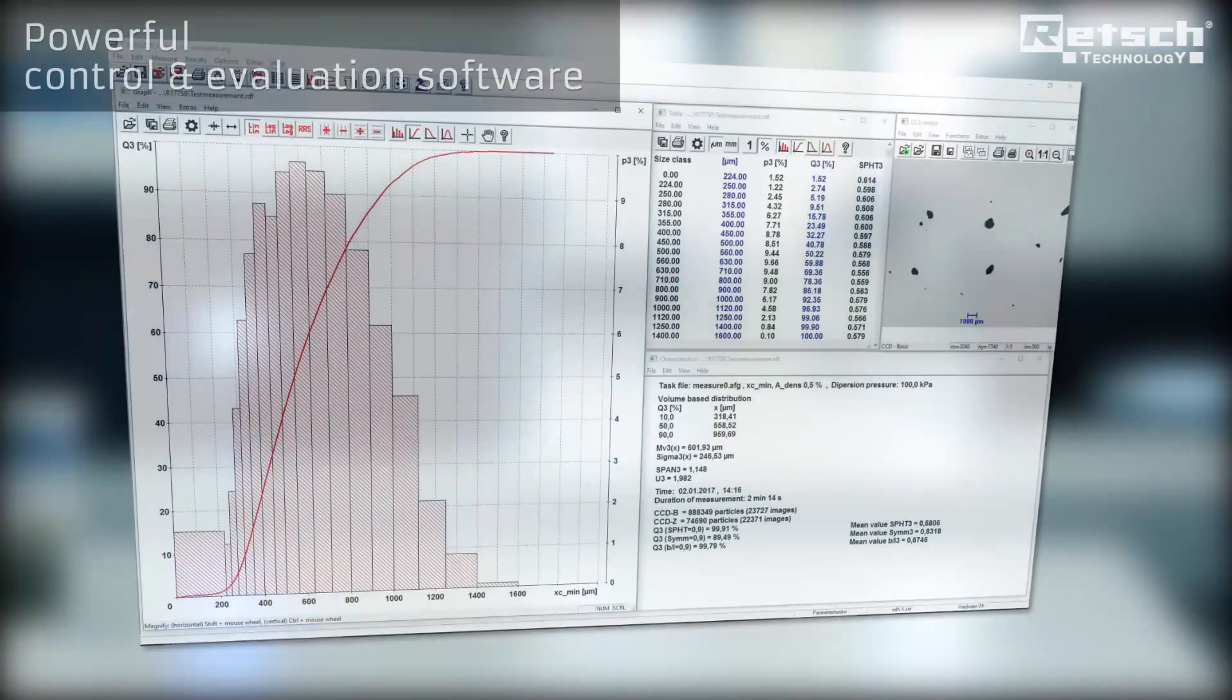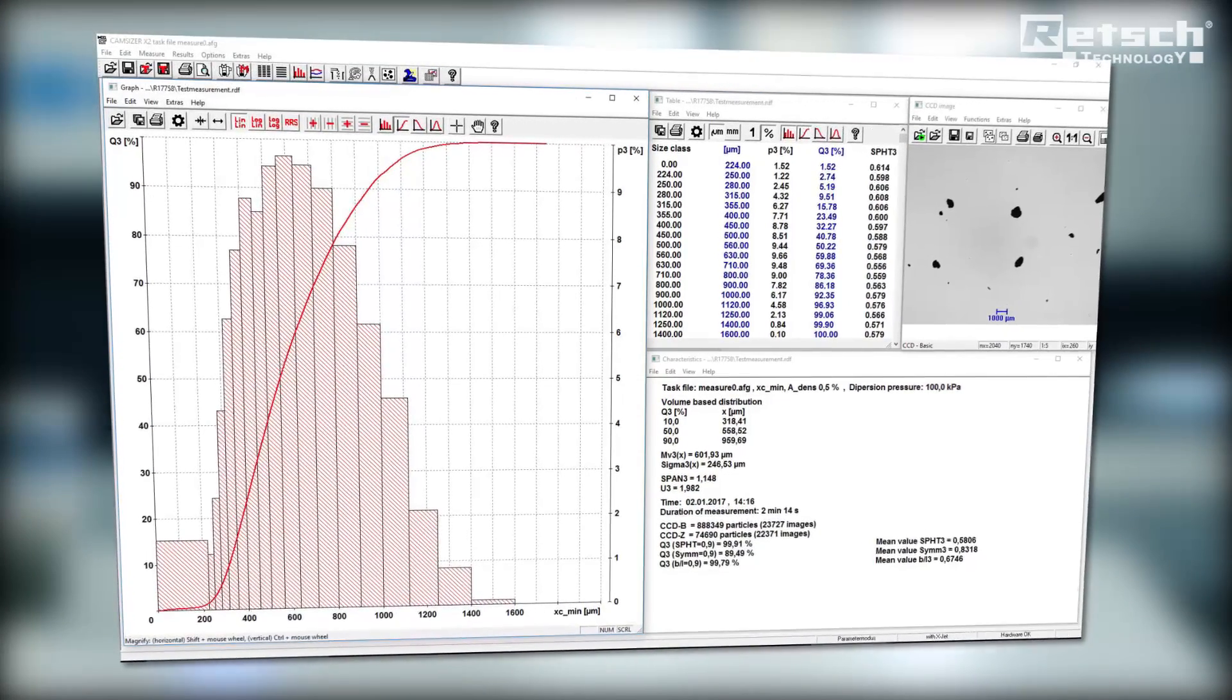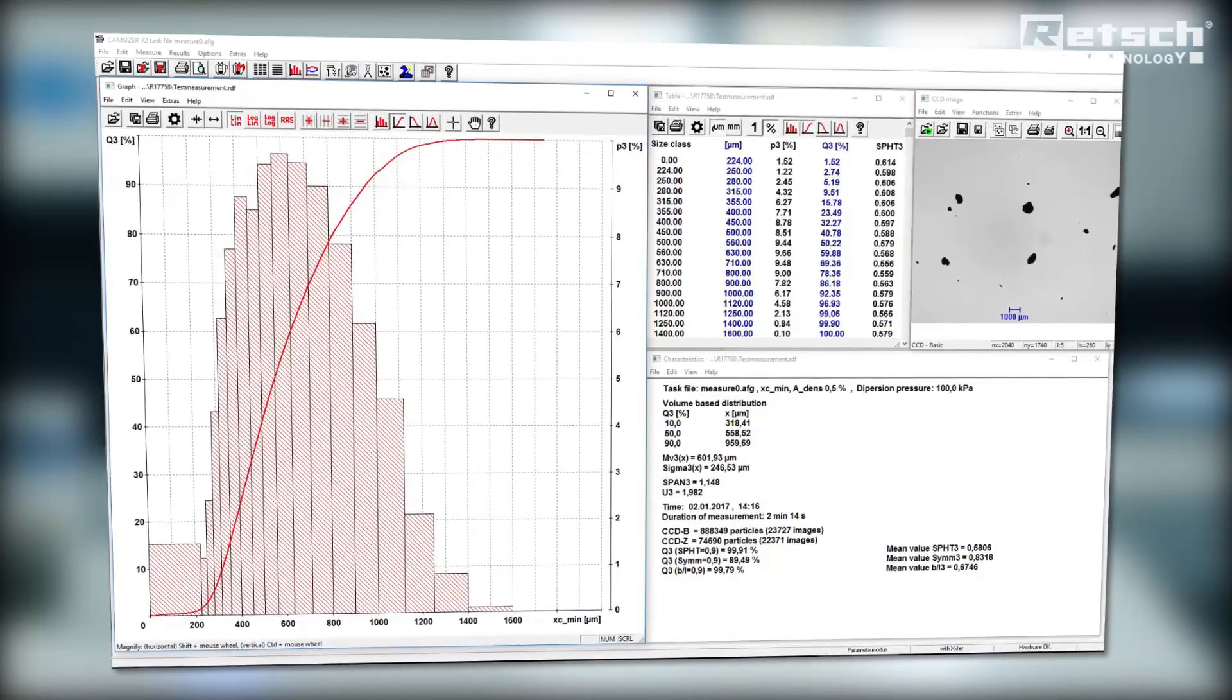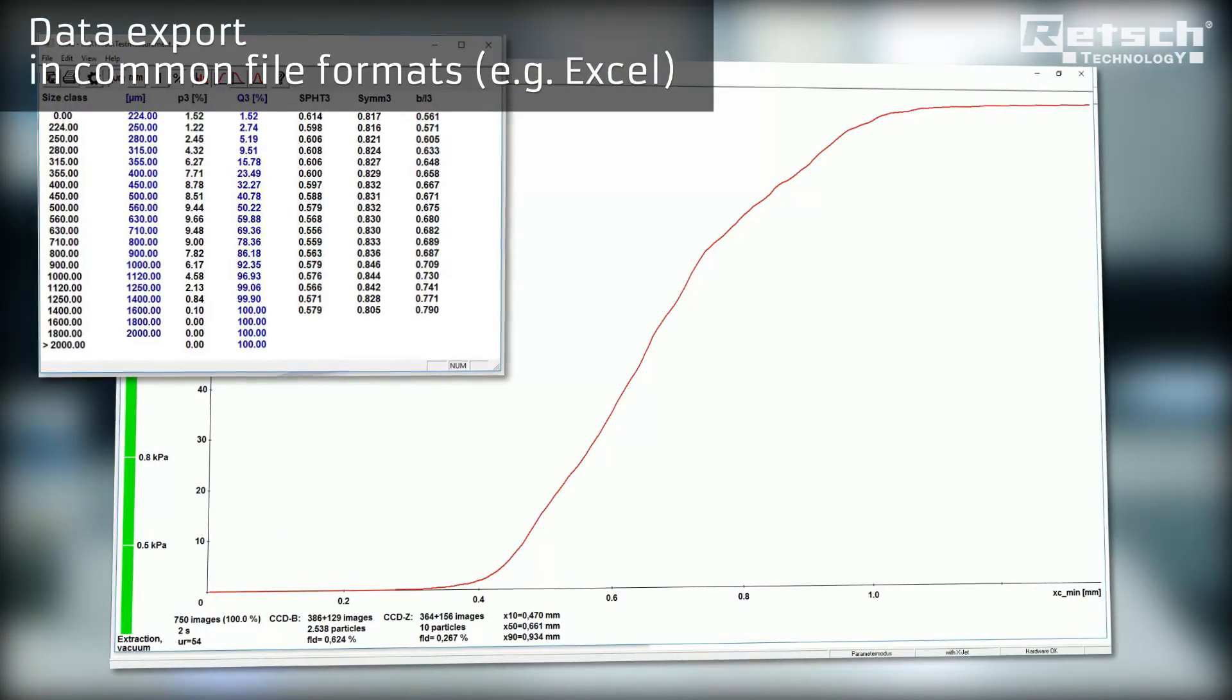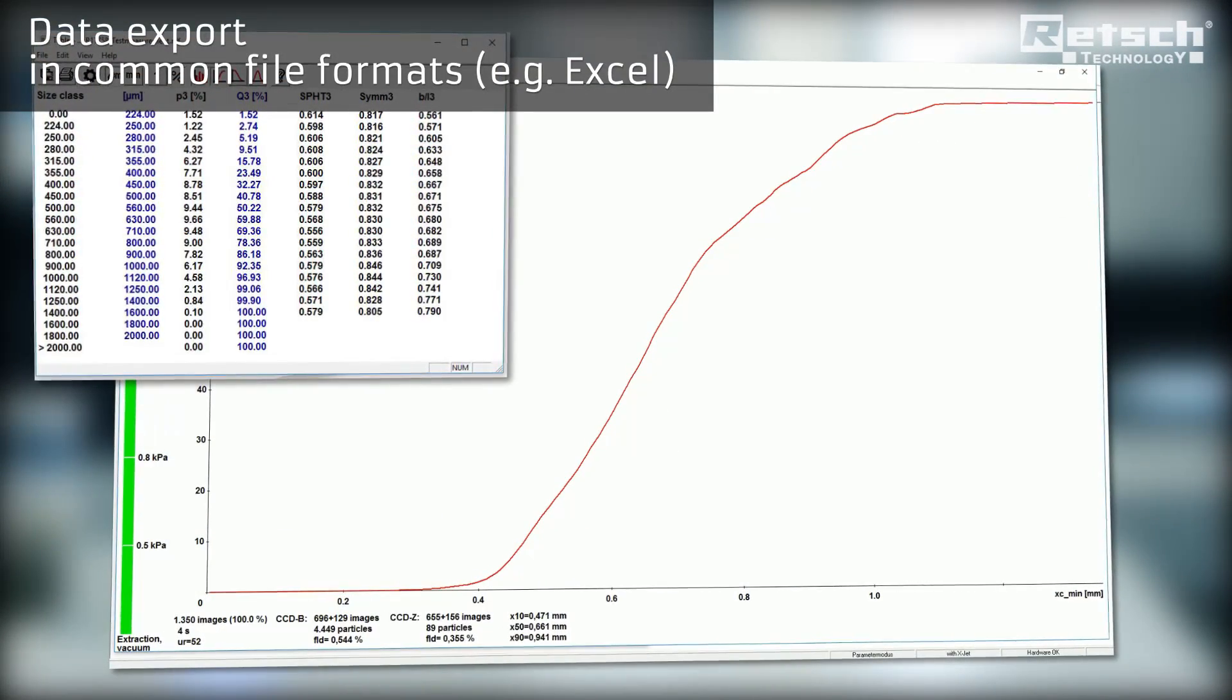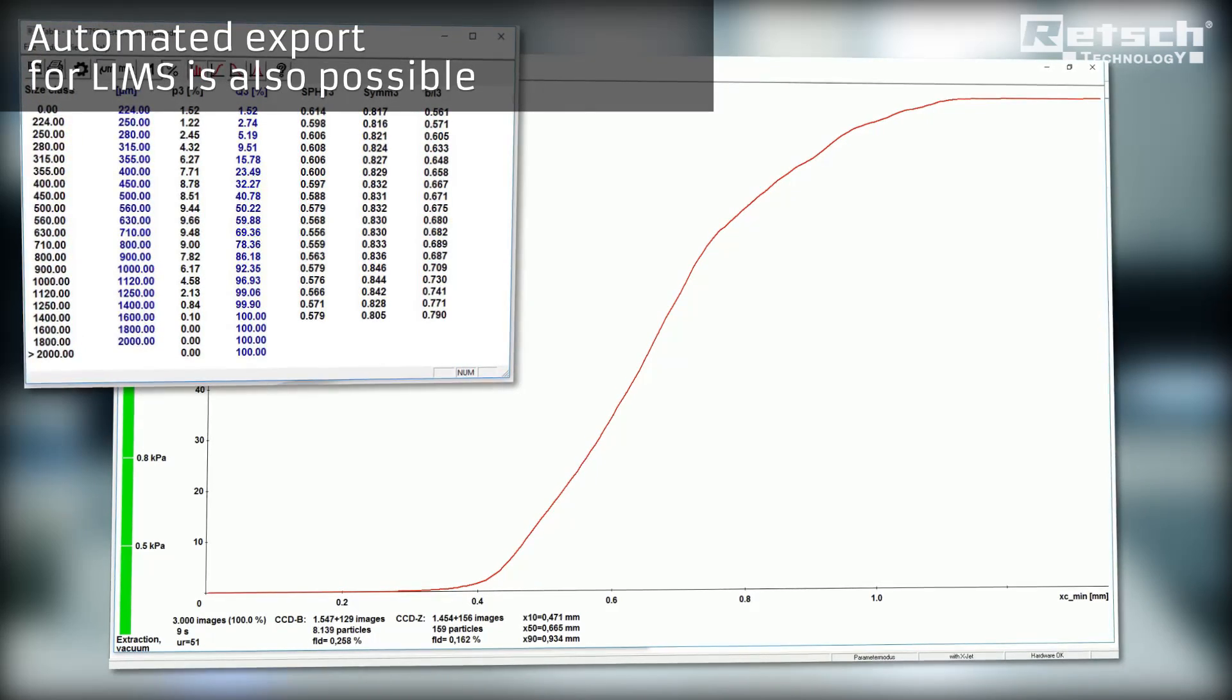RECH Technology supplies the CamSizer X2 complete with an elaborate and powerful control and evaluation software. Measurement data are displayed in tables or charts and can be exported in common file formats like Microsoft Excel. An automated data export for laboratory information management systems is possible.